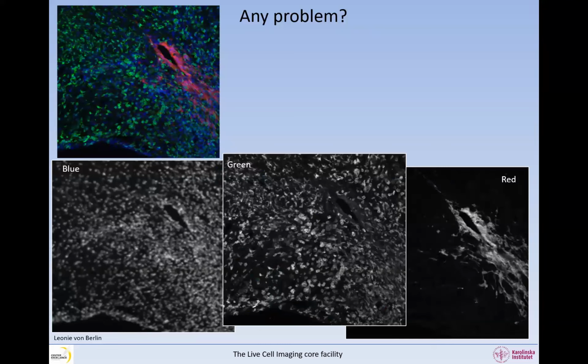There's a problem of low resolution. Low resolution? Where do you see that? It looks out of focus to me. Which one, blue is out of focus, but the green is in focus. Exactly. We focused on the red, and the red is in focus. The green is in focus. The blue is not in focus. I've told you what it is, right? Yeah, you said it's because of the refractive index mismatch.